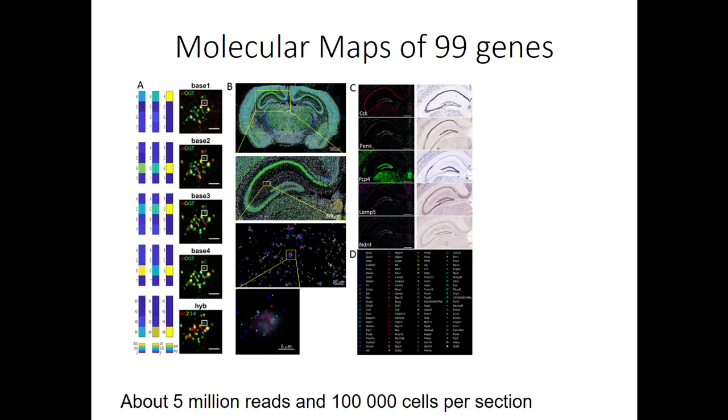Here are some example distributions of marker genes in our data, compared to the Allen Brain Atlas, which has comprehensively mapped all mouse RNAs onto mouse brain tissues, gene by gene. They don't have a combined profile as we have, it's just a single gene kind of map. And here are the genes we're targeting. We have compared our distributions with the Allen Brain Map for all the genes, and when we can compare, they look very comparable.